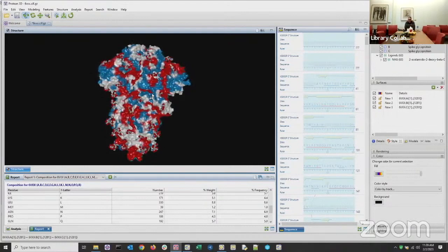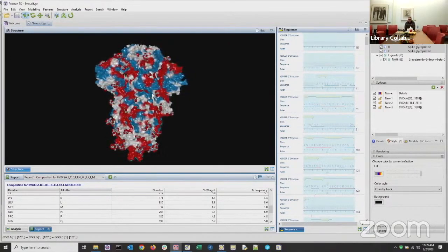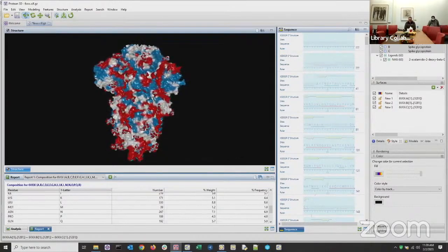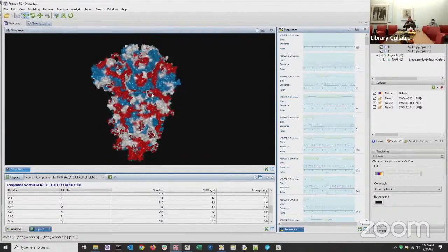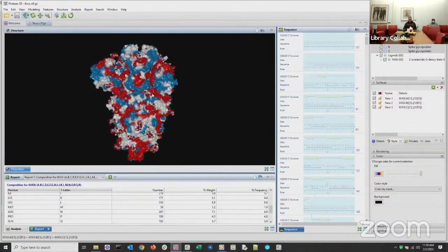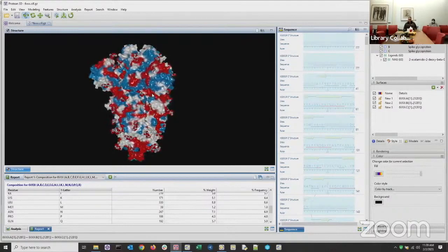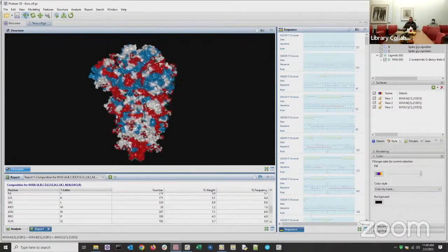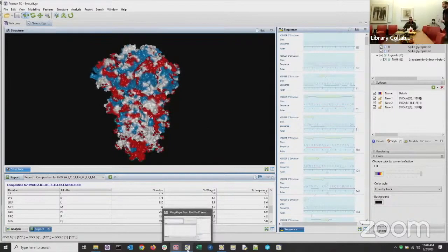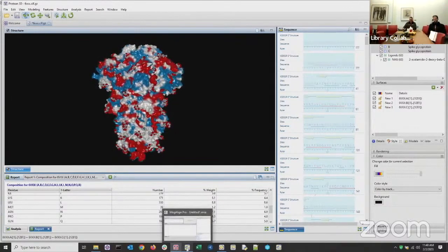So today, I have a presentation on a new functionality that we're releasing actually this week that allows us to look at any bacterial or viral genomes and how the nucleotide data represents changes in the proteins of different strains. And specifically, I'm going to be working with some COVID-19 strains, around 340 of them.